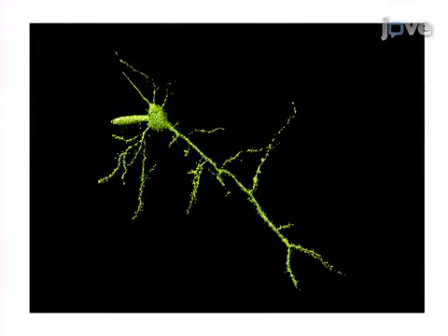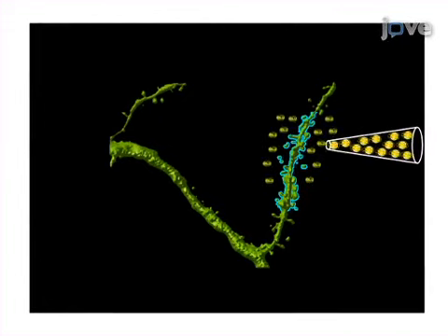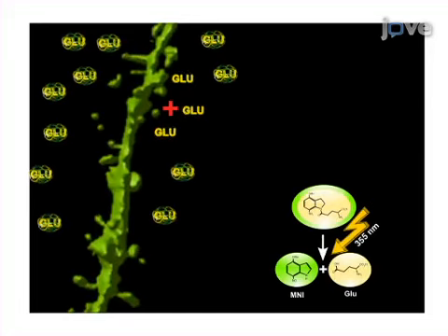The next steps are to choose a spiny dendrite for the experiment, and to focally inject a photoactivated compound, such as caged glutamate, close to this dendrite. A UV flash is then applied to focally uncage glutamate using a UV laser that has been accurately positioned to target a small volume close to the dendrite of choice.